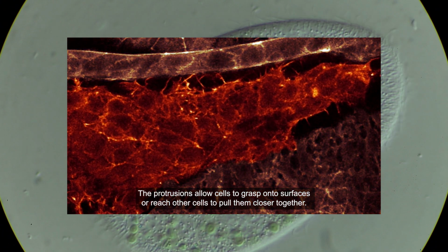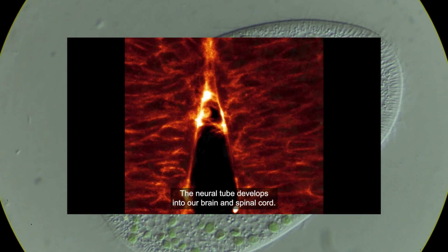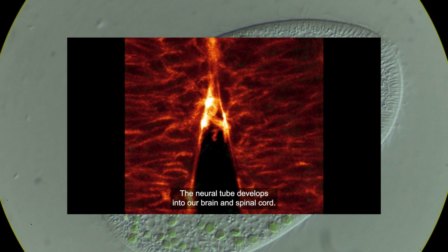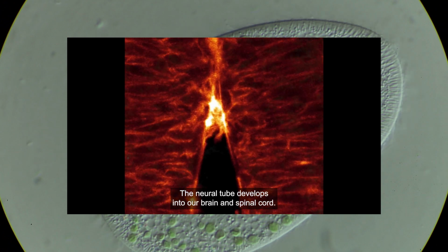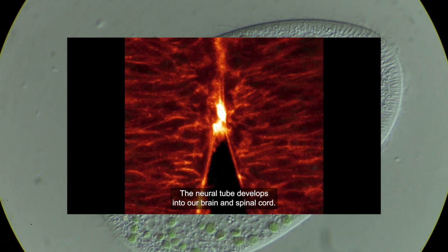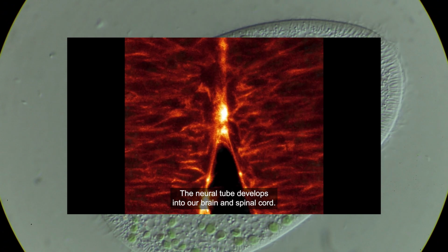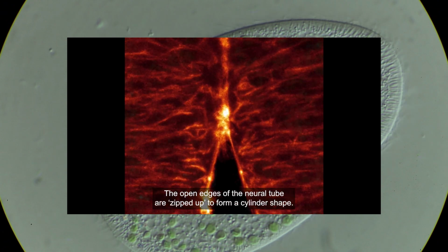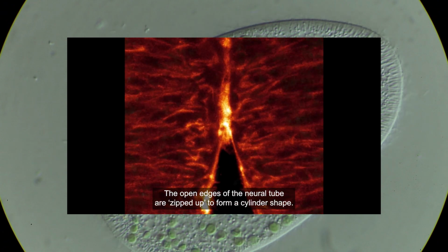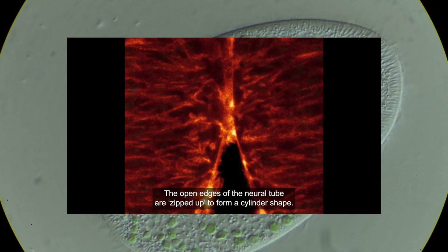The other issue is particularly around live cells. Now, we've mentioned that recent research, and understand this is recent as in only the last few weeks of it being published, shows that you can look at live cells and keep them alive the entire time. But when you do so, and one reason why they had to use bird embryos in egg, is that the process of exciting the fluorescent compounds can lead to phototoxicity.